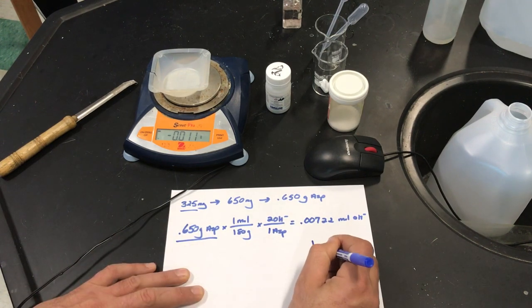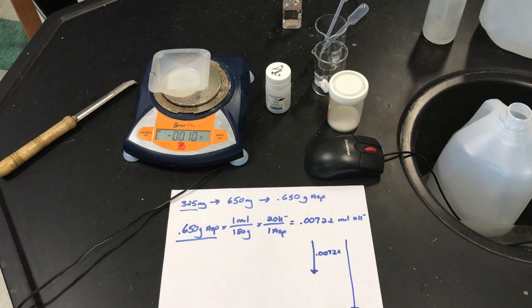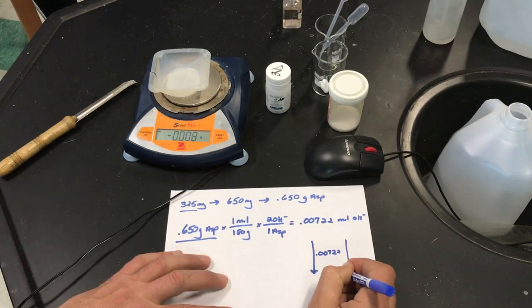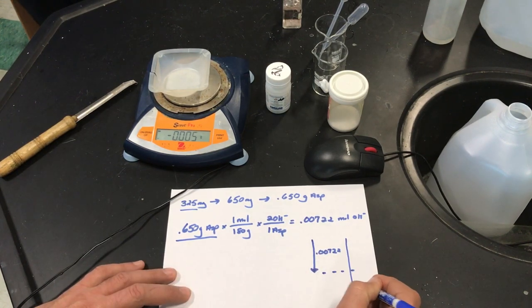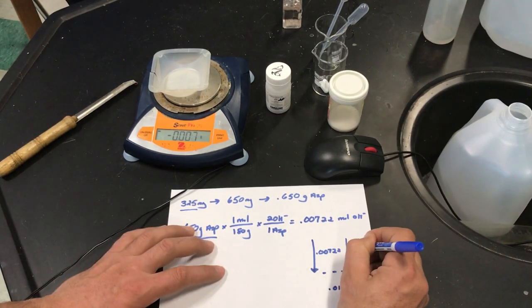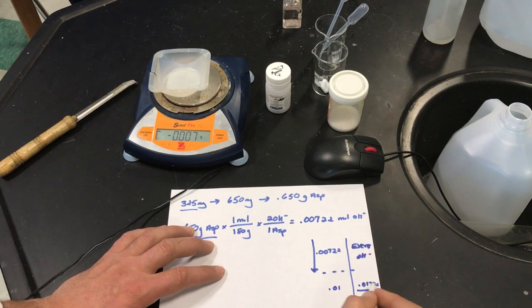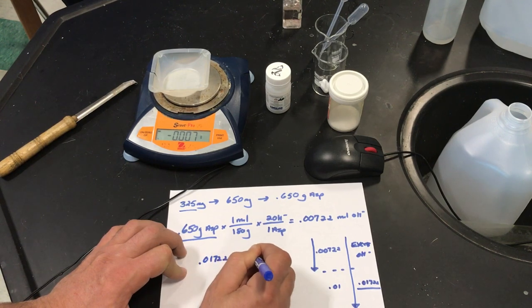That's 0.00722 — that's our target. But we need to add excess because it's a back titration — we're going to drive the reaction forward. One of your virtual lab partners wanted the excess to be 0.01, so added to that gives 0.01722. Her target excess is 0.01, giving a total of 0.01722 moles of hydroxide needed.